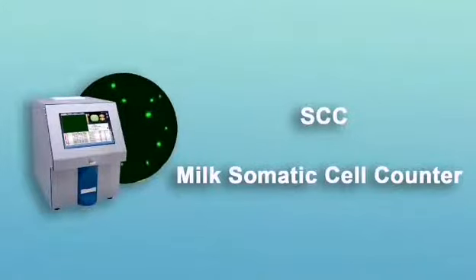Hello, here is Hany Tech. Today I will introduce the SCC milk somatic cell counter.